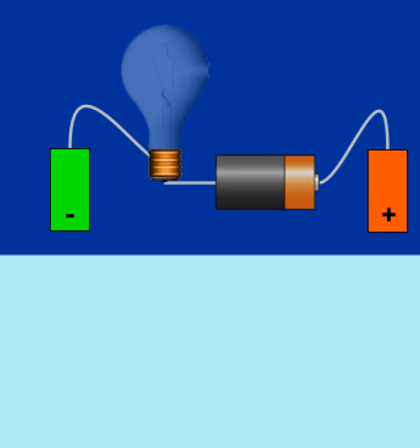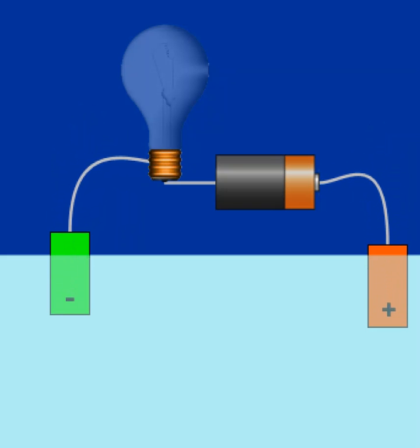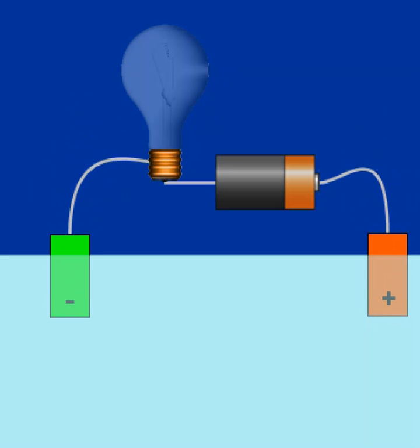So when we put our electrodes in, this is 1 molar sucrose, which is concentrated, but I get no light because there are no ions. Let's see what happens if I use the more dilute sucrose. This is the 0.1 molar sucrose. So more dilute, still just molecules in there. We don't have any conductivity, no light at all.